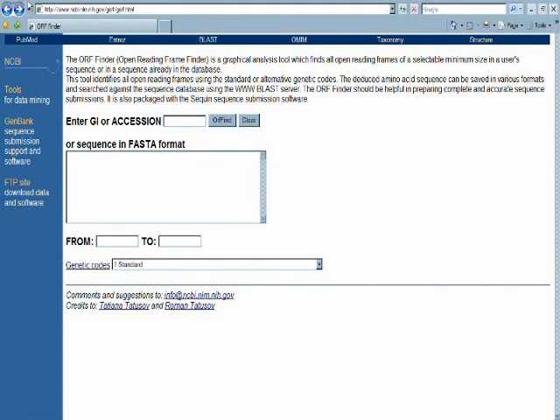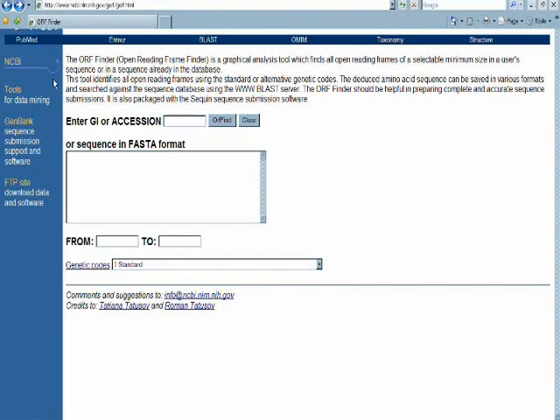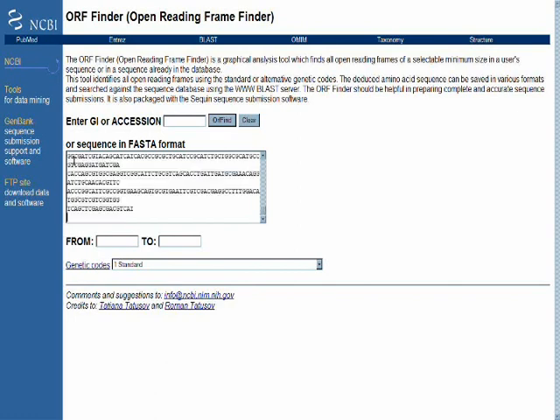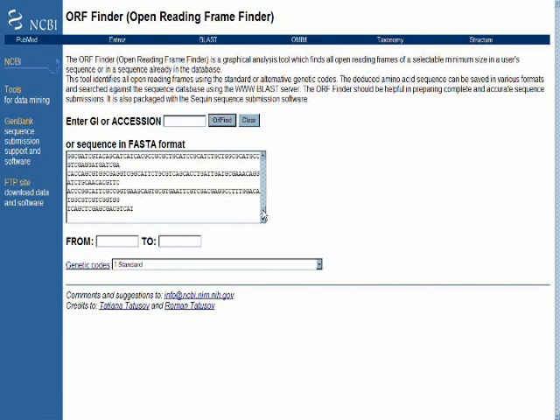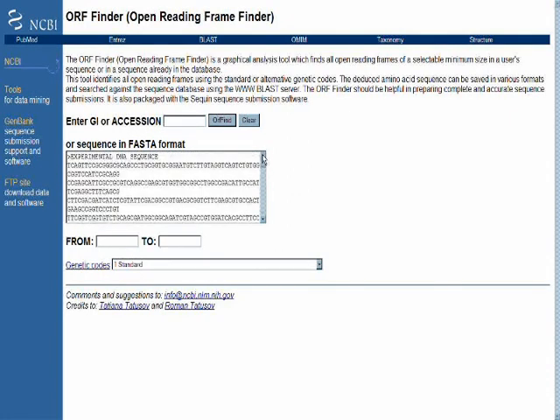The Open Reading Frame Finder utility, located at the URL at the top of the browser, is a program available at the National Center for Biotechnology Information, or NCBI, website that allows us to find potential protein encoding sequences or open reading frames in sequences that we paste into the query box using the FASTA format.